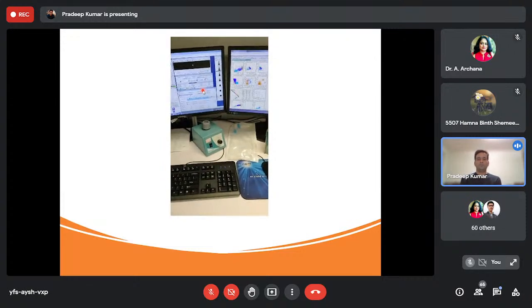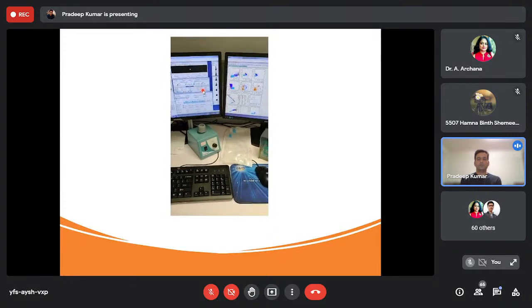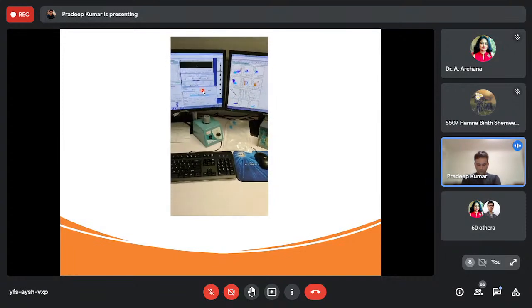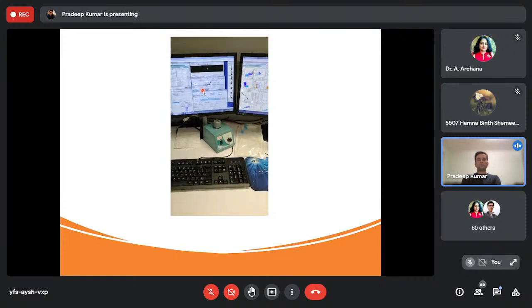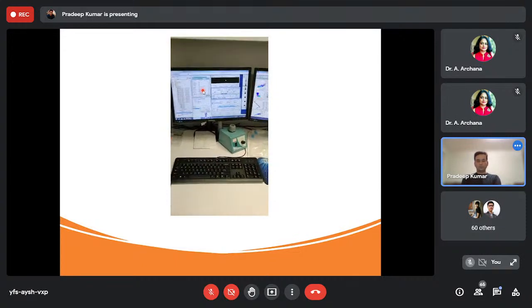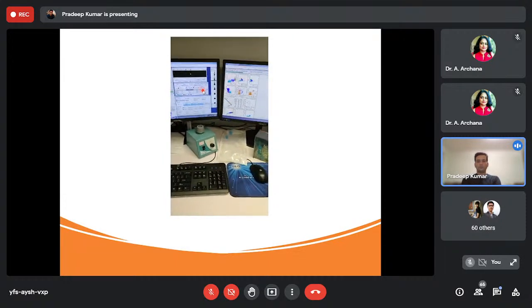In my presentation, I'm going to include different components of the flow cytometer. Those components include fluidics, the second component is optics, and the third component is the electronics of the instrument. The main purpose of the fluidics is to bring your cells to the point of interrogation, when the cells and laser interact with each other. That happens in the flow cell assembly. The moment interrogation happens, the fluidics part is over.